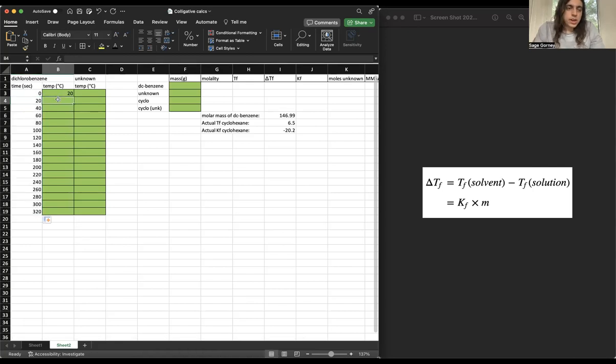Quick and easy. All right, so we're going to now decrease our temperature according to the data you received in your first, I think it was part 2, for your dichlorobenzene measurements. Just plug in your data here for all of your time measurements. Okay. So what I'm going to do here, I'm going to paste in some sample data. Don't use it. It'll give you incorrect results and will be obvious that you used fake data because we also have your pre-labs. So don't do that. Yeah, just pasting that in.